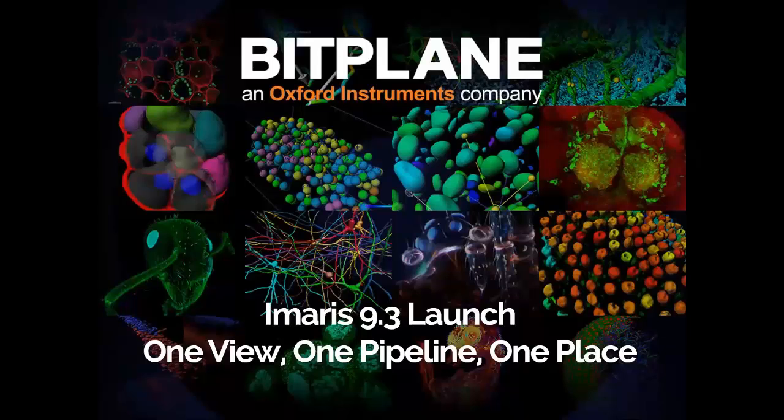I think I speak for the entire team when I say that we really love being, even if it's just a small part of your work and your daily life, part of that and helping you perform the work that you need to do and be part of the science that you're doing. We want to make sure that you have the software and the resources to enable you to do your work better and faster and to do things in new, innovative ways. That's where we come in, to help you get there faster, and that's where Imaris 9.3 comes in.